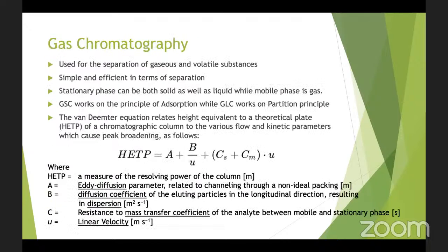So now moving on to gas chromatography. As the name suggests, the mobile phase that is used in gas chromatography is gas, while the stationary phase may be either solid or liquid. If we are using a solid stationary phase, then the gas chromatography is known as gas solid chromatography, or GSC. The principle behind GSC is the adsorption phenomenon.